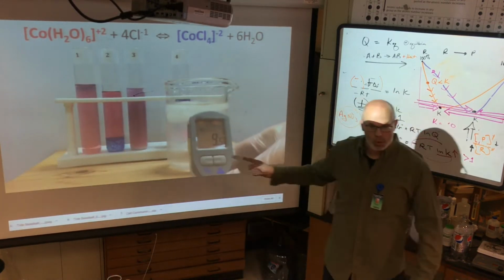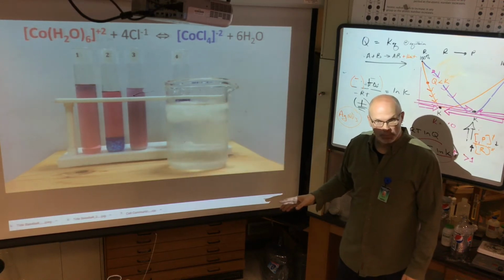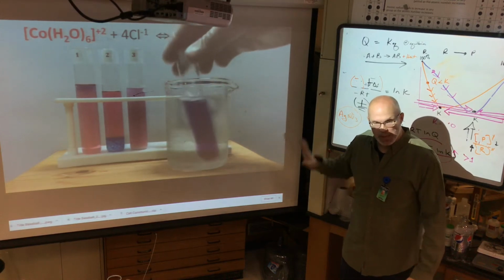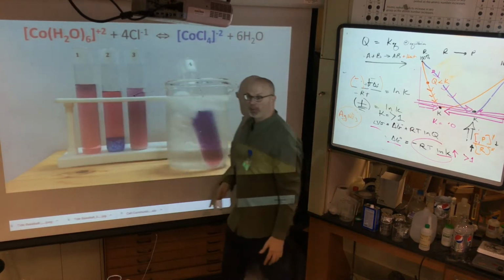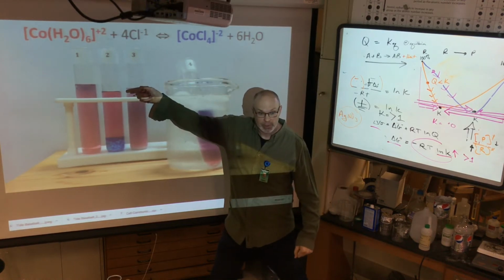Let's do the opposite. Okay, this is a cold water bath. What did we learn? On lower temperatures, we favor the exo or the endo? Exo. Take the heat away, you're going to make more heat. So I have something blue. If the heat is on this side, party people, isn't the exothermic the reverse reaction? And shouldn't I move?